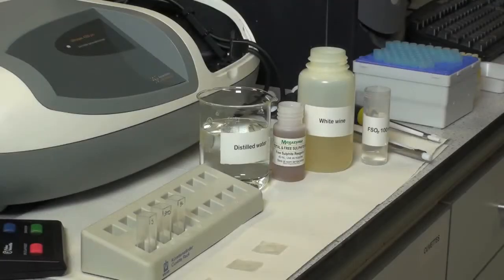Each batch of samples requires a standard, which is either a single point standard or a full calibration curve using standard 0 through to standard 5 and a blank.